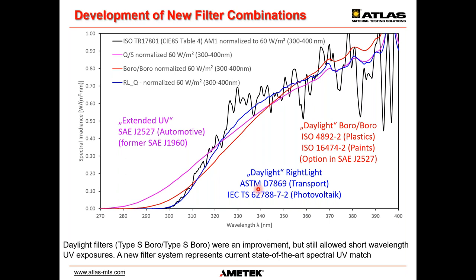Something about the UV cut-on, which also talks about the precision of xenon arc instruments. And I'll tell you a little bit of the story about the times when extended UV filters came up for extra acceleration. They are full of UVC and short wavelength UVB radiation, because the thought was that a lot of short wavelength will provide us a short test. The knowledge today is that it also produces a lot of correlation mismatches, or correlation problems, because you can trigger other pathways than natural, and sometimes accelerate in the wrong way, so to say.